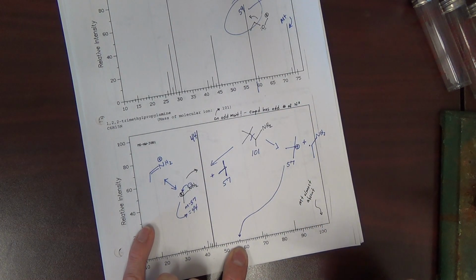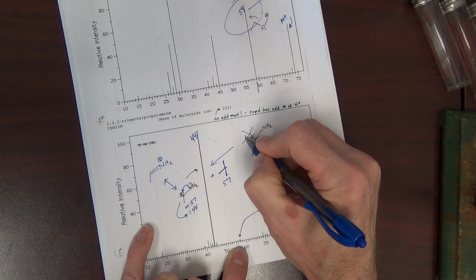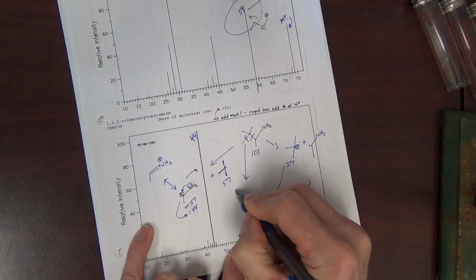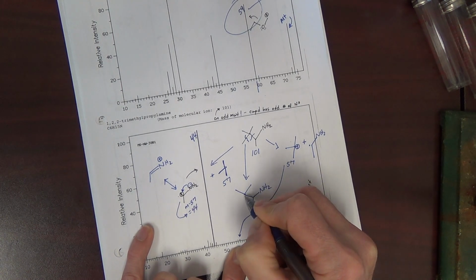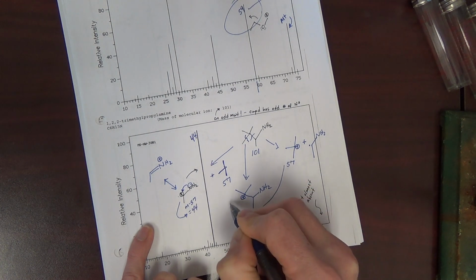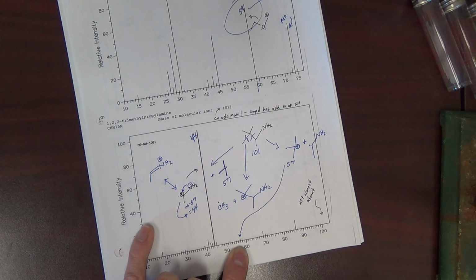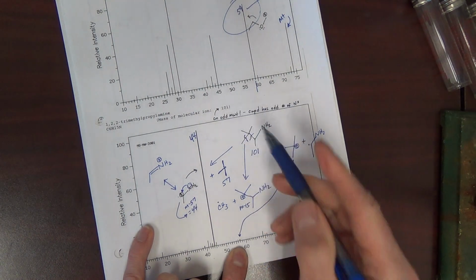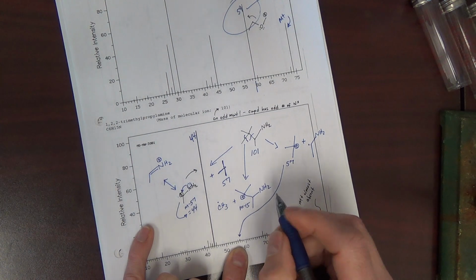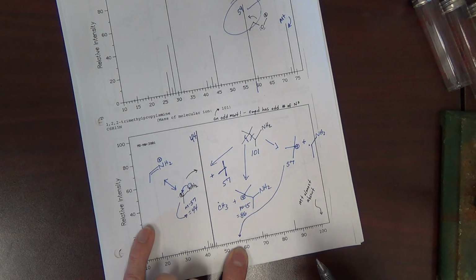Is there another potential cleavage that might be reasonable and we could argue had some stability? What if we cleaved here, and put the cation there, plus a methyl radical. This would be M minus 15 because we just lost 15. 101 minus 15 should be 86. Do we have 86? Ah, we do.